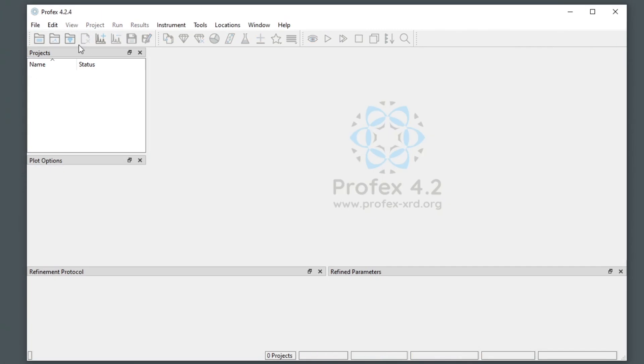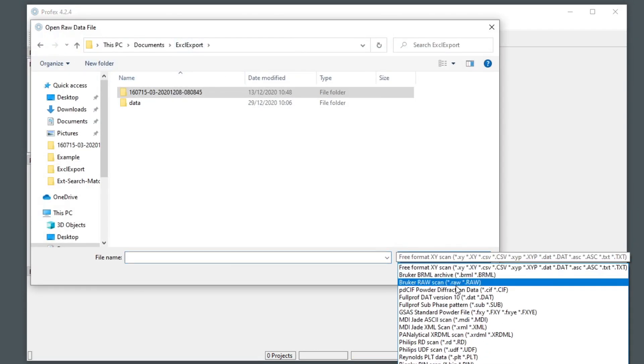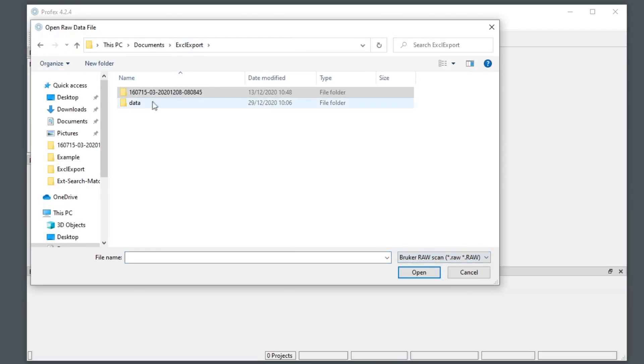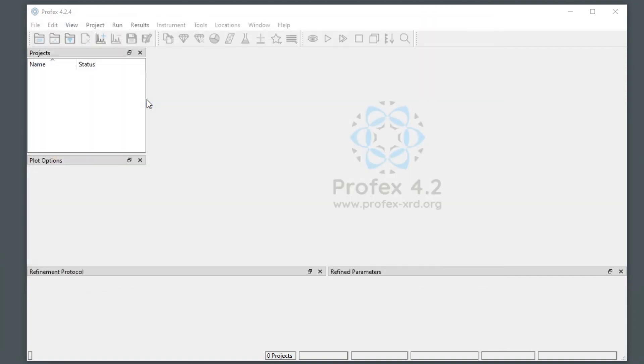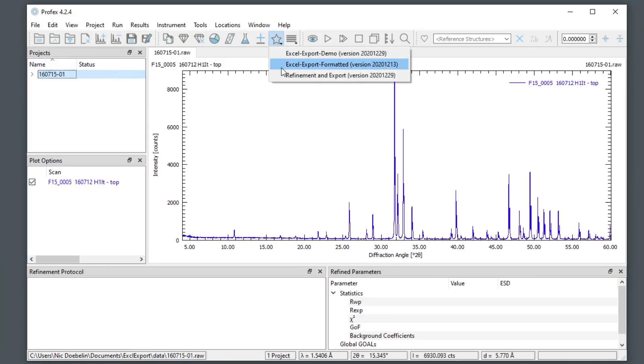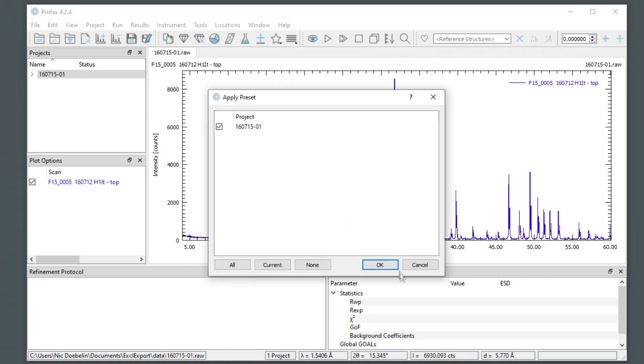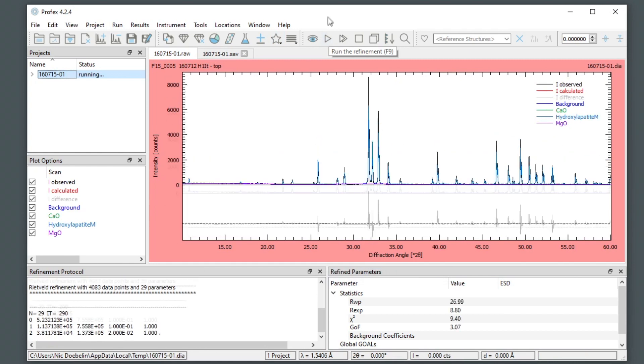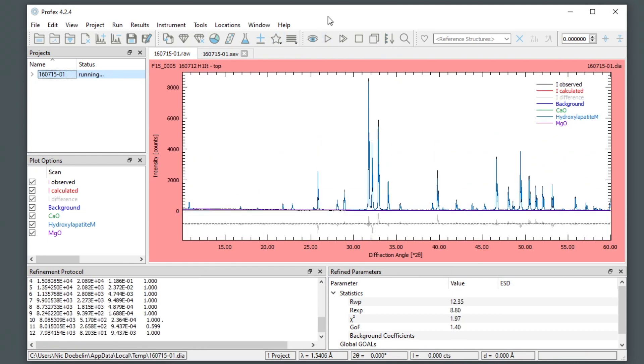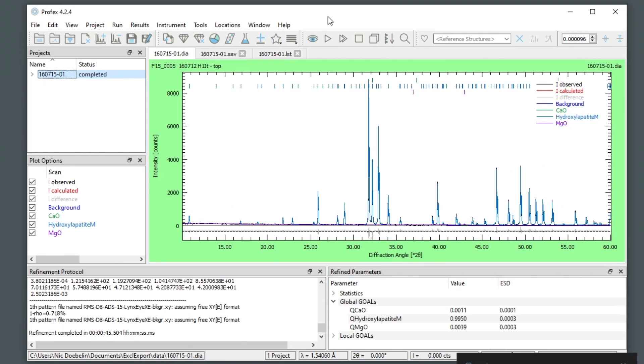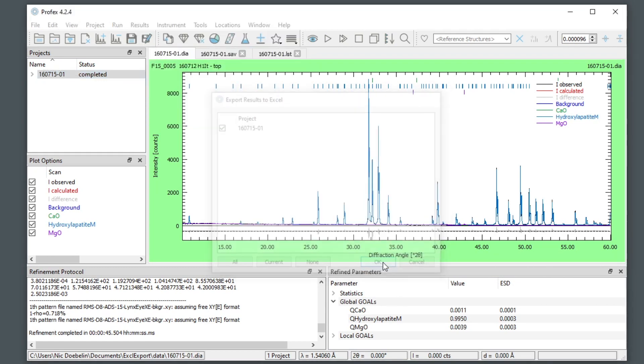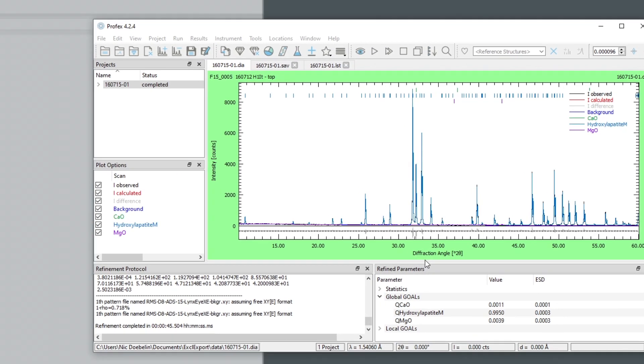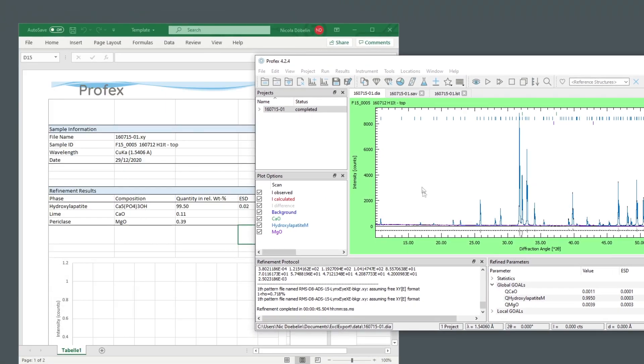And now if I want to process a new scan file, for example, this one, I can apply the new refinement preset, run it, and when it's done, I can immediately export the results to Excel, because the configuration was already applied when I applied the refinement preset.